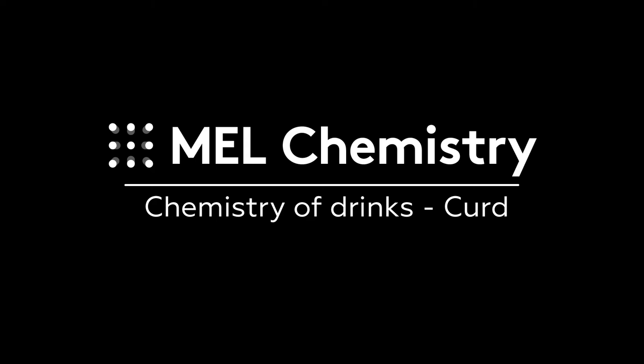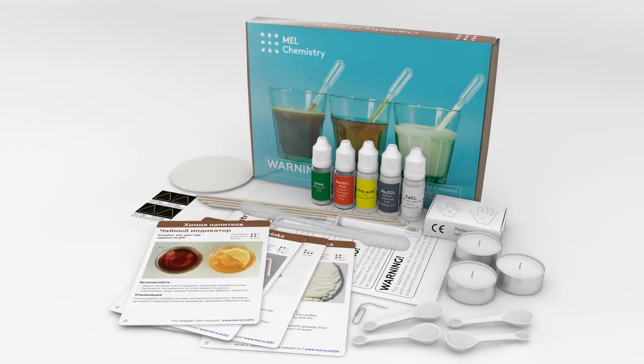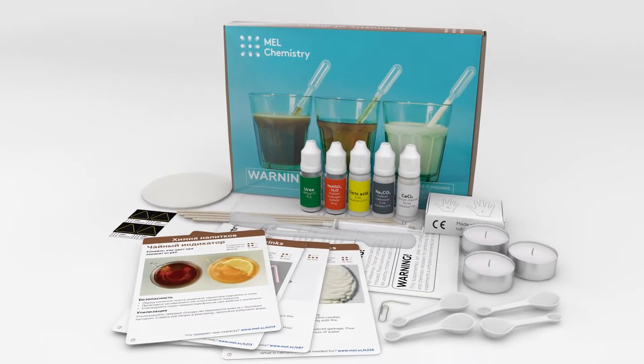Welcome to the wonderful world of chemistry. Today with the help of the chemistry of drinks set by MELChemistry, we will see how calcium chloride makes milk curdle.